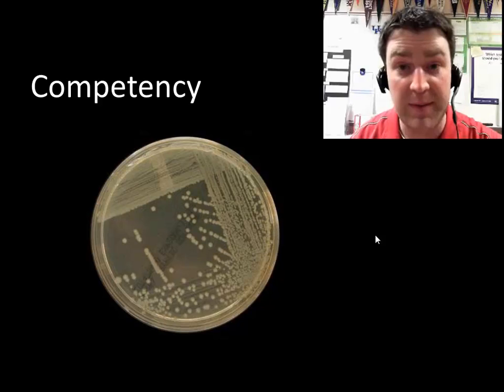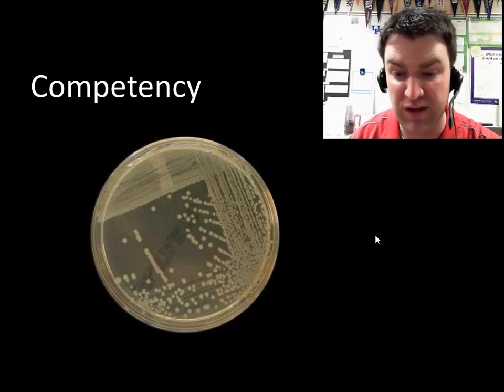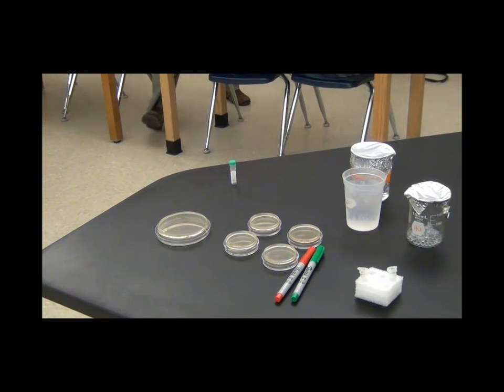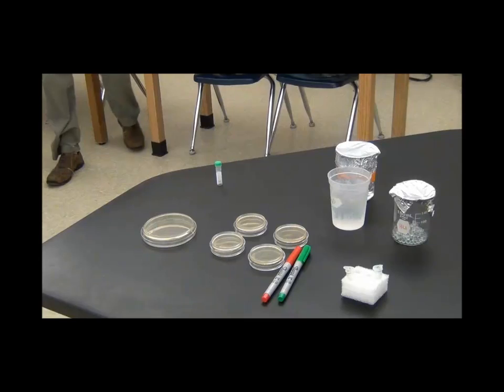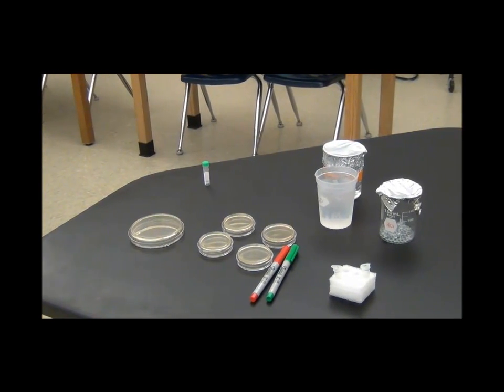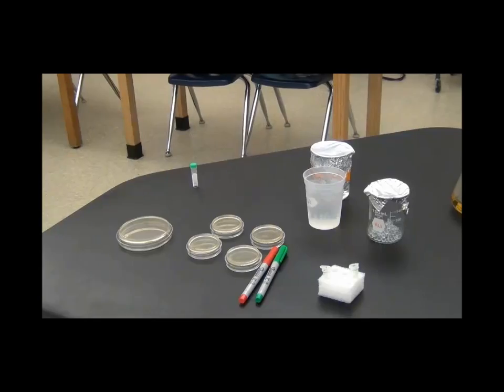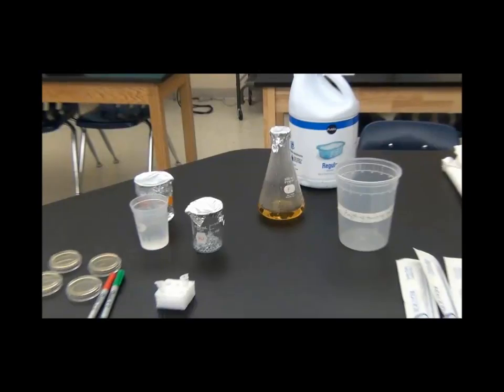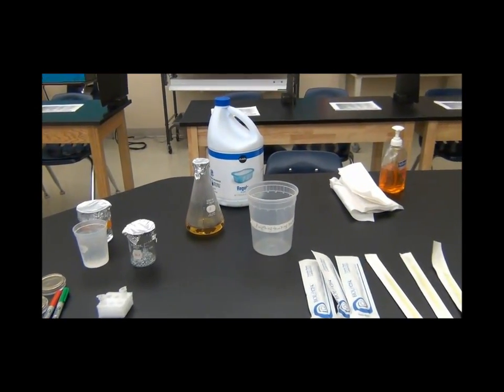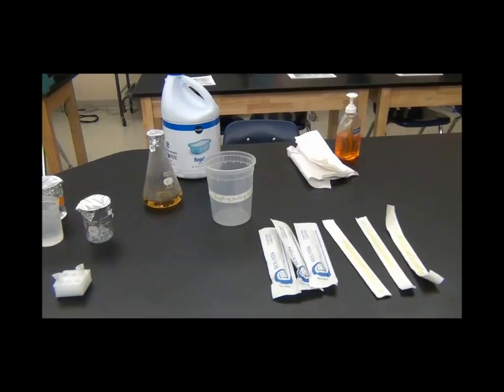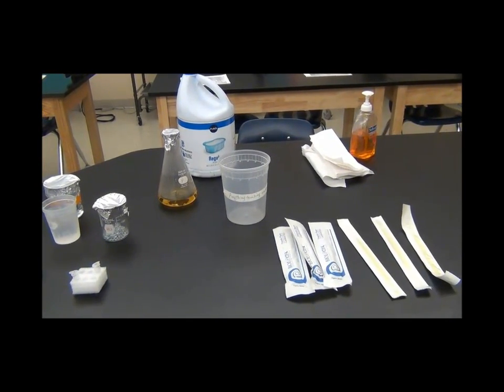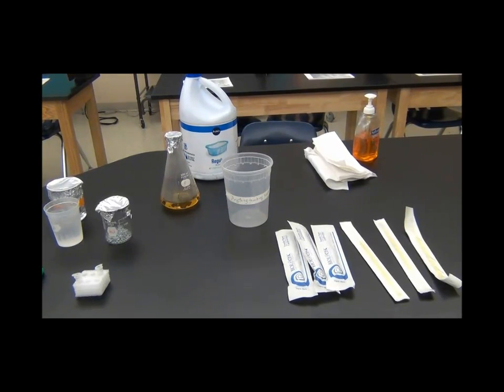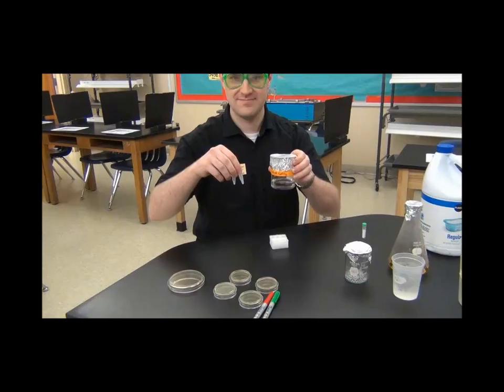So the next part of the video I'm just going to narrate some video of myself running through some of the materials and procedures of this lab. So let's introduce you to some of the materials. You'll have a big starter plate with bacteria. You'll have four plates that are free of bacteria that will be your test plates. The plasmid is in that little thin tube. You've got sterile glass beads and sterile chemicals, calcium chloride and the yellow luria broth. You've got a disposal container and you've got lots of sterile equipment pre-wrapped, pipettes and sterile loops. You've also got soap and bleach to disinfect later.